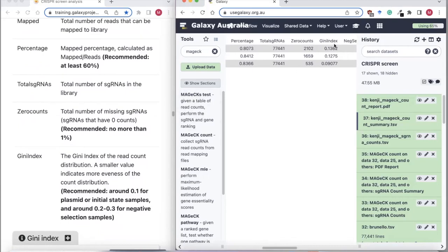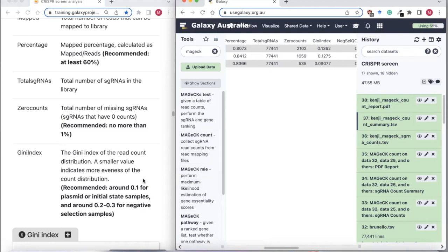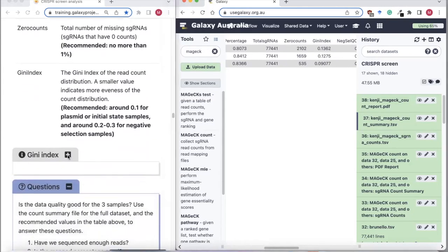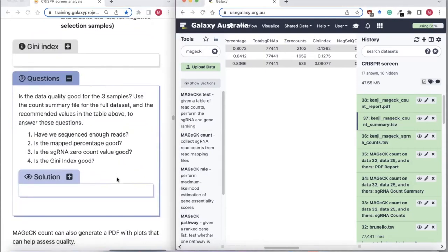We also get the Gini index, which is an important metric — it's a measure of how even the distribution of guides is. If we were doing a positive selection screen, it would be okay to have high values here. But we're doing a negative selection screen, so we want to see small Gini index values, and that's what we see. These metrics for these samples are pretty good.